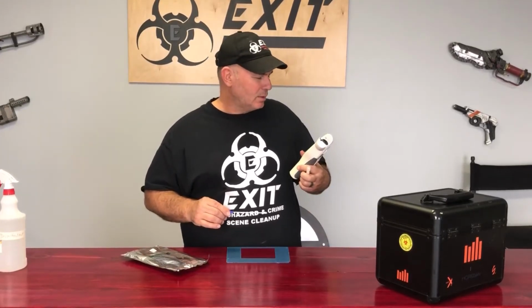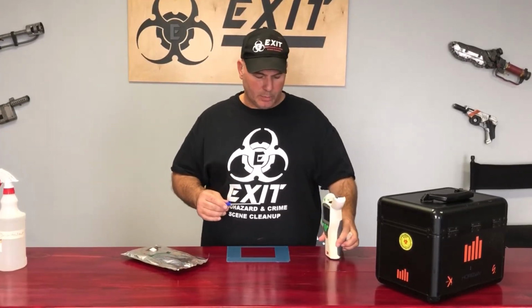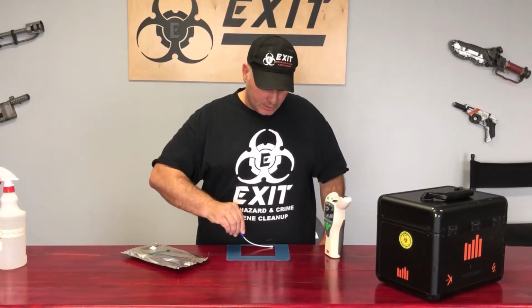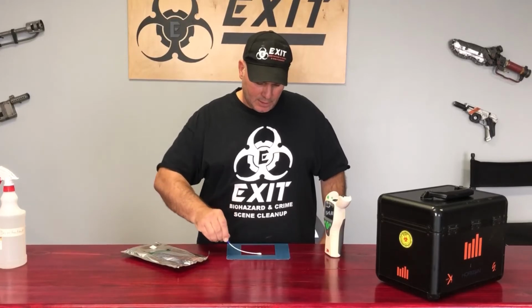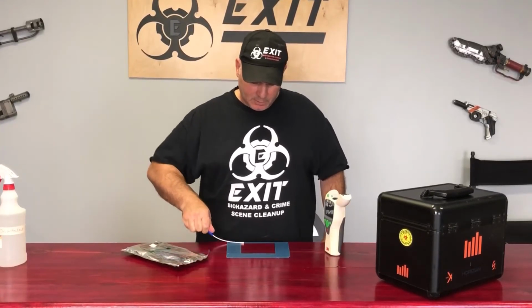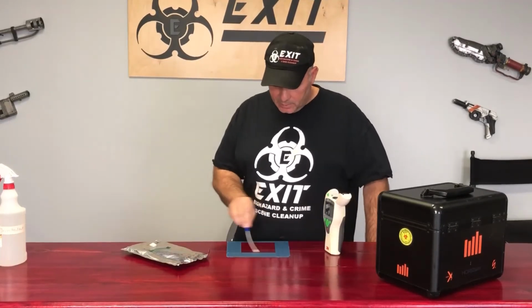Got a little beep here. Oh, the chamber door is open. It's a chamber of secrets here. So let's do that. You can see I have a bend in it, and I'm rotating it as we go a little bit. We went that way, and now we go this way.